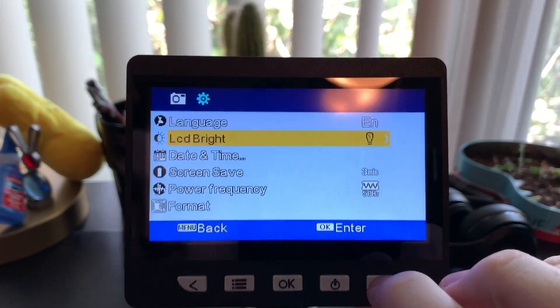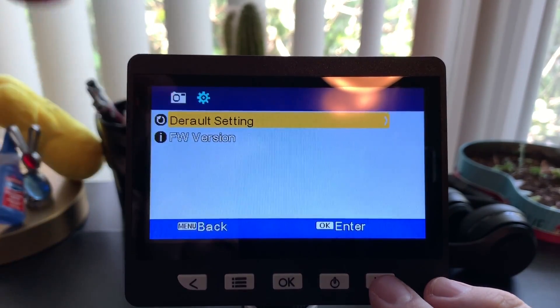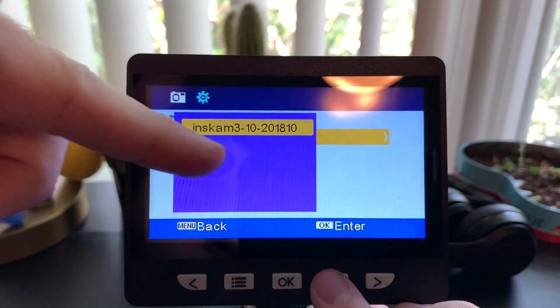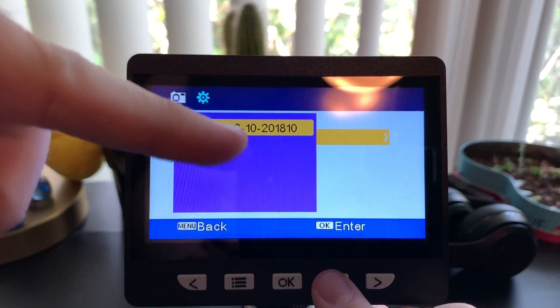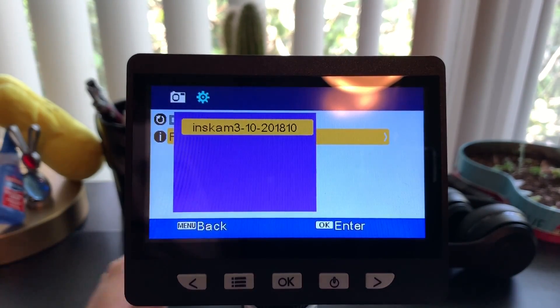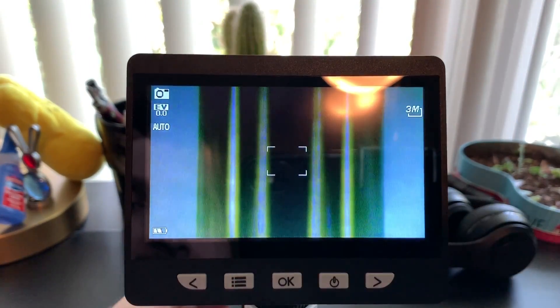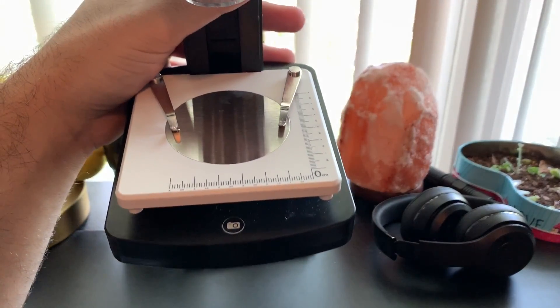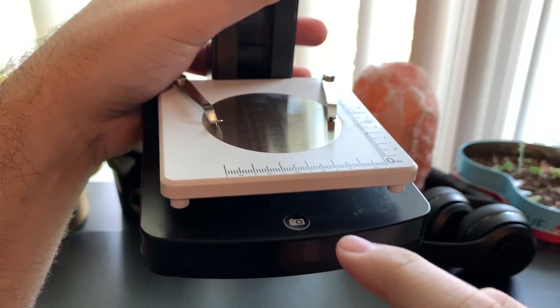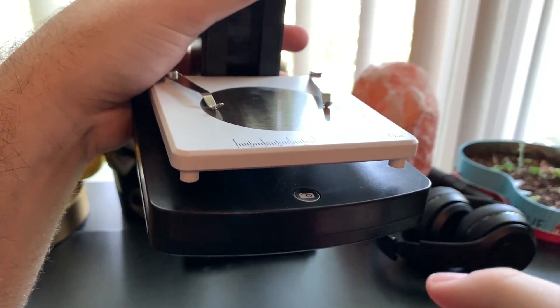Scrolling further, there's a default setting to reset everything, and the current firmware version — looks like it's from March 10th of 2018. Pressing the button repeatedly takes you back to the main menu. One thing I should have mentioned earlier is the camera shutter button — this is the button that actually takes the picture or starts a video, depending on your choice. You can hear the nice strong click.